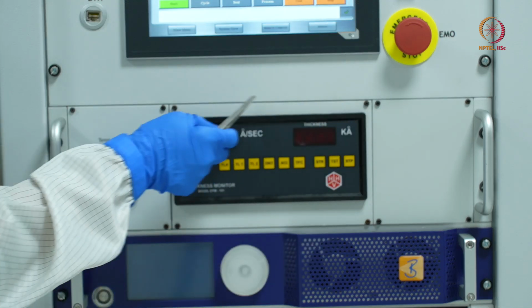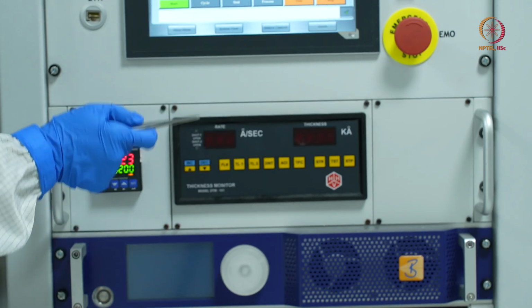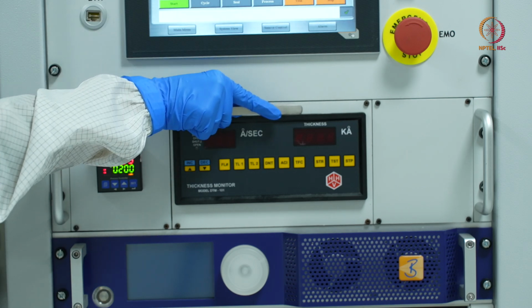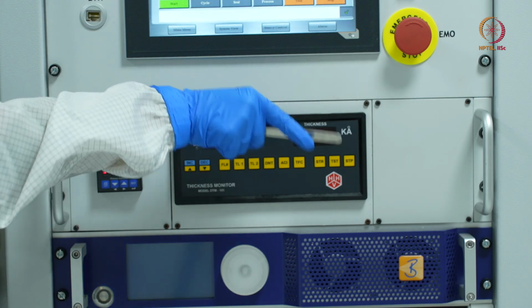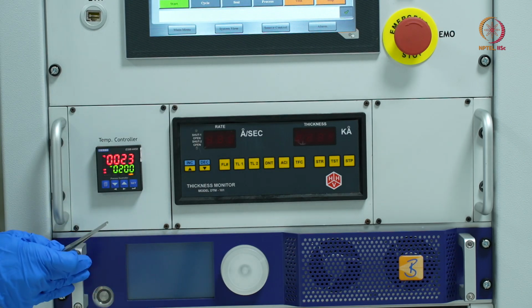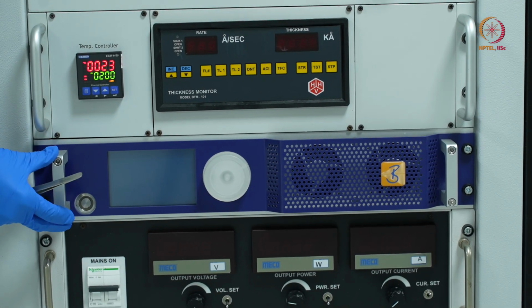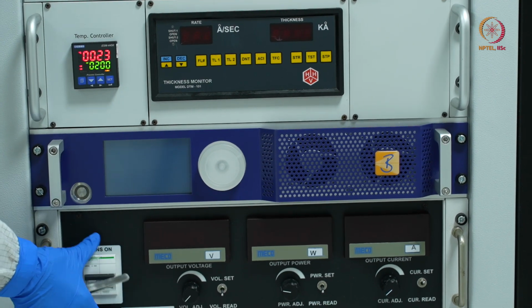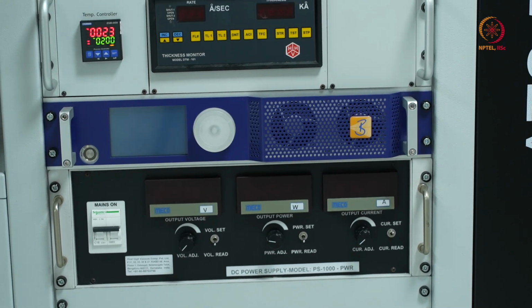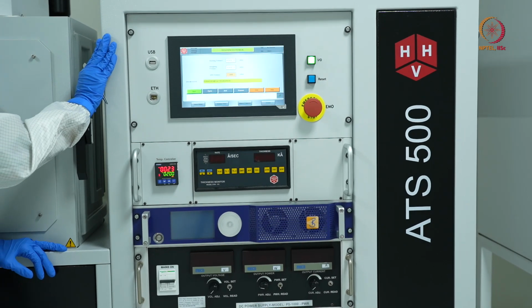This is the digital thickness monitor. Here we'll see what the rate of deposition is and how thick a film has been deposited up to a particular point. This complete panel is for RF sputtering, and this panel is for DC sputtering. This tool can accommodate or can be used for RF sputtering and DC sputtering.